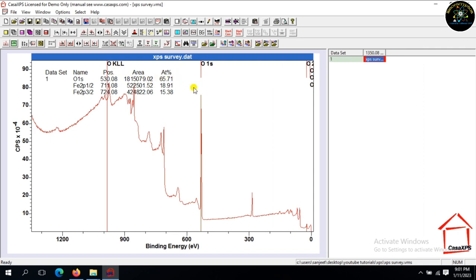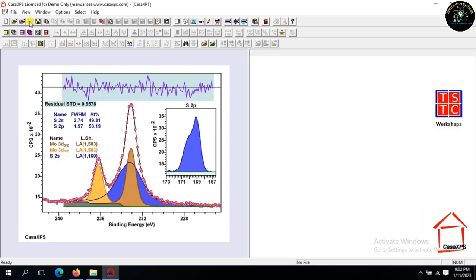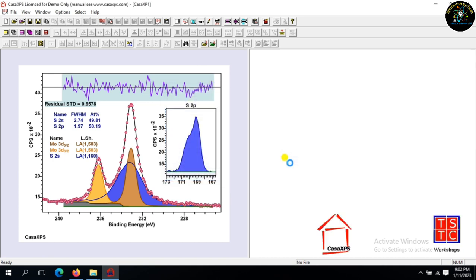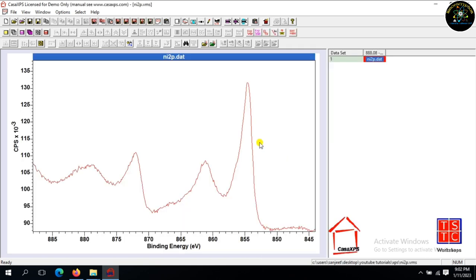See the atomic percentage of oxygen and iron. Now, again, similarly, I have done with the nickel spectrum to estimate the atomic percentage of nickel atom.